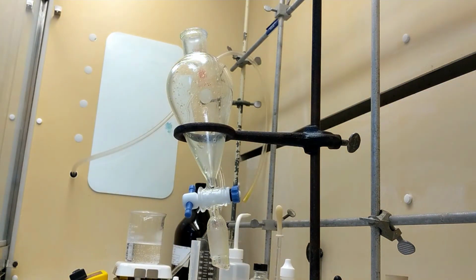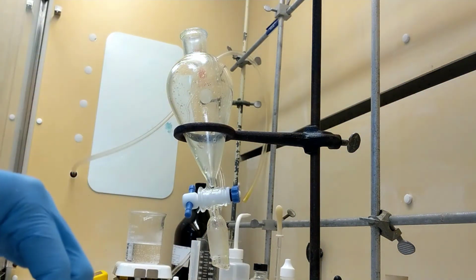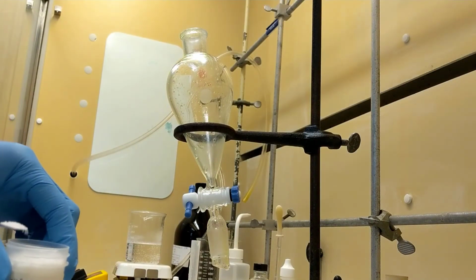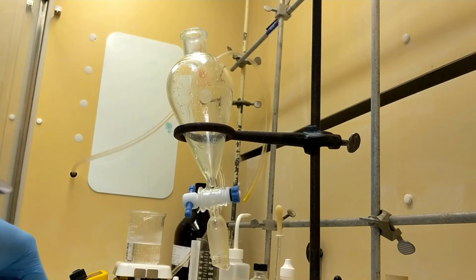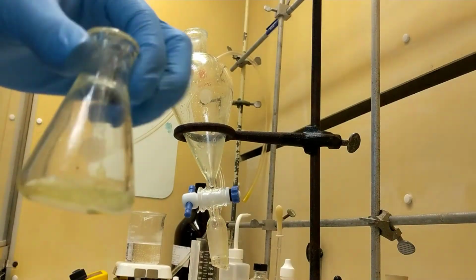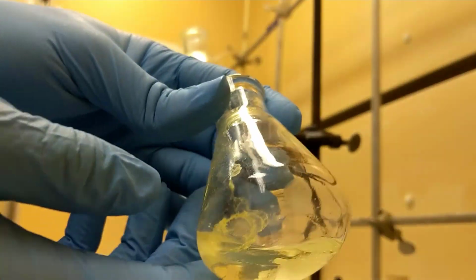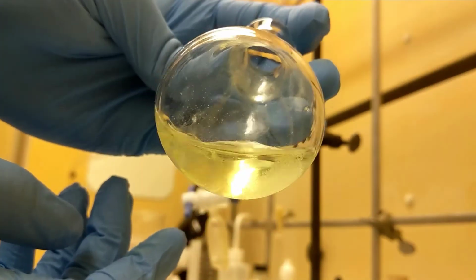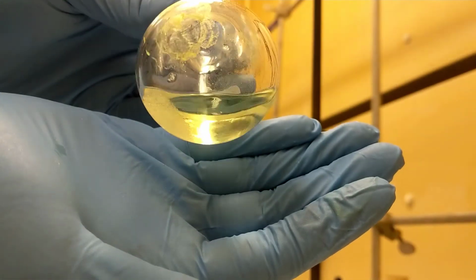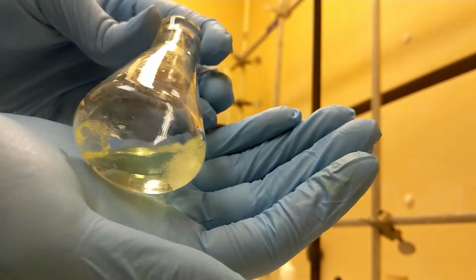Boom. Maybe just a little more. Yeah, that's good. I'll show you guys. Here it is. You can see down there. See how loose and non-clumpy it is? That's what we're looking for.